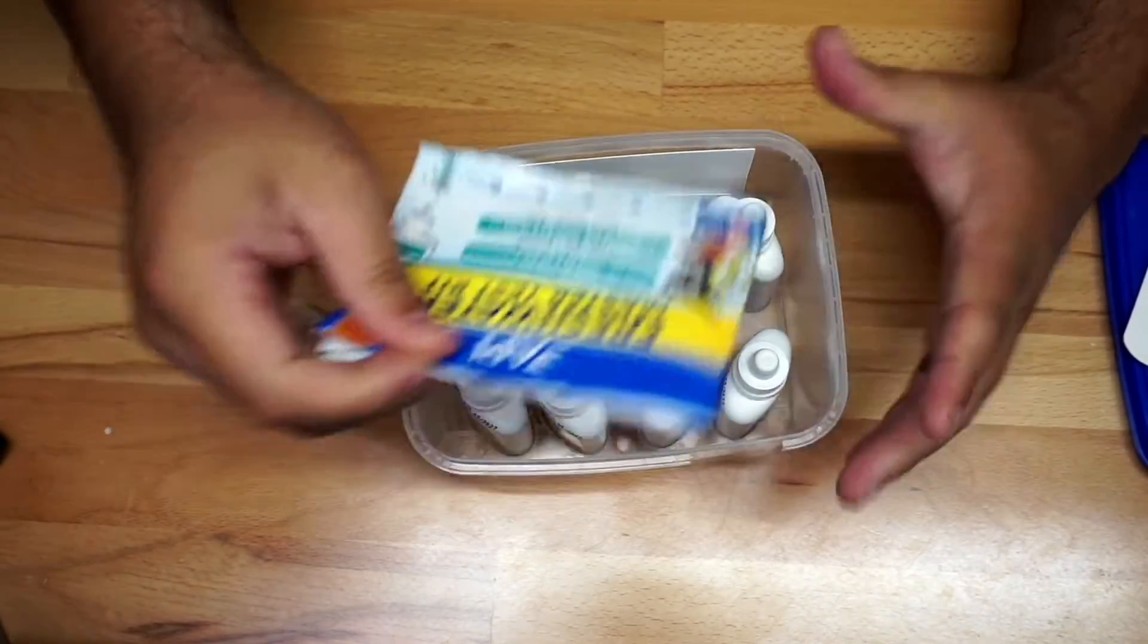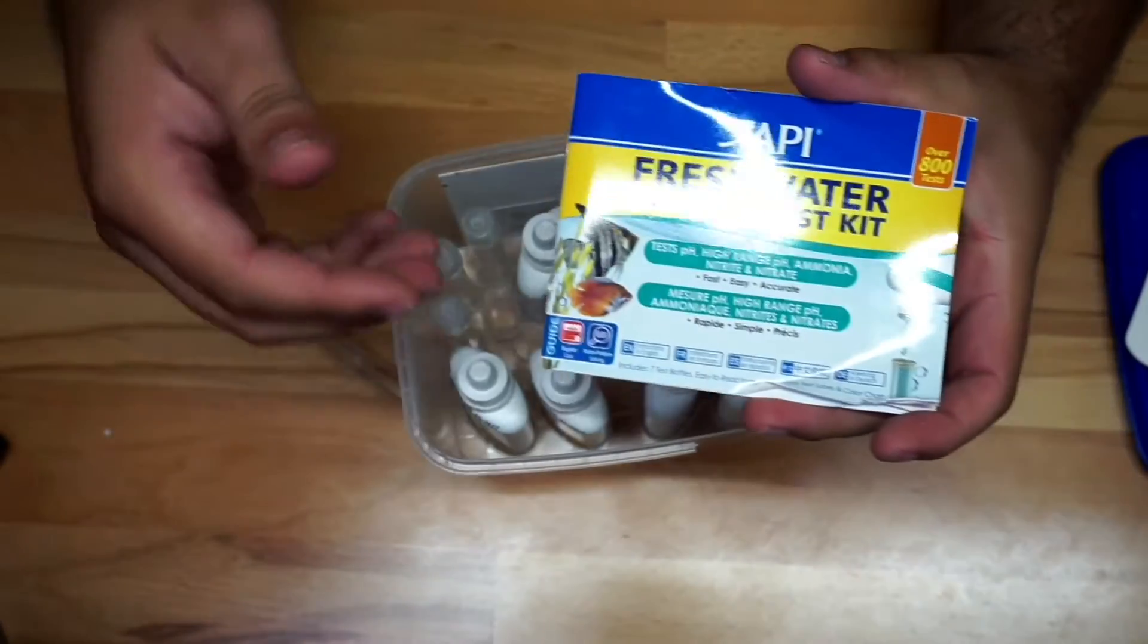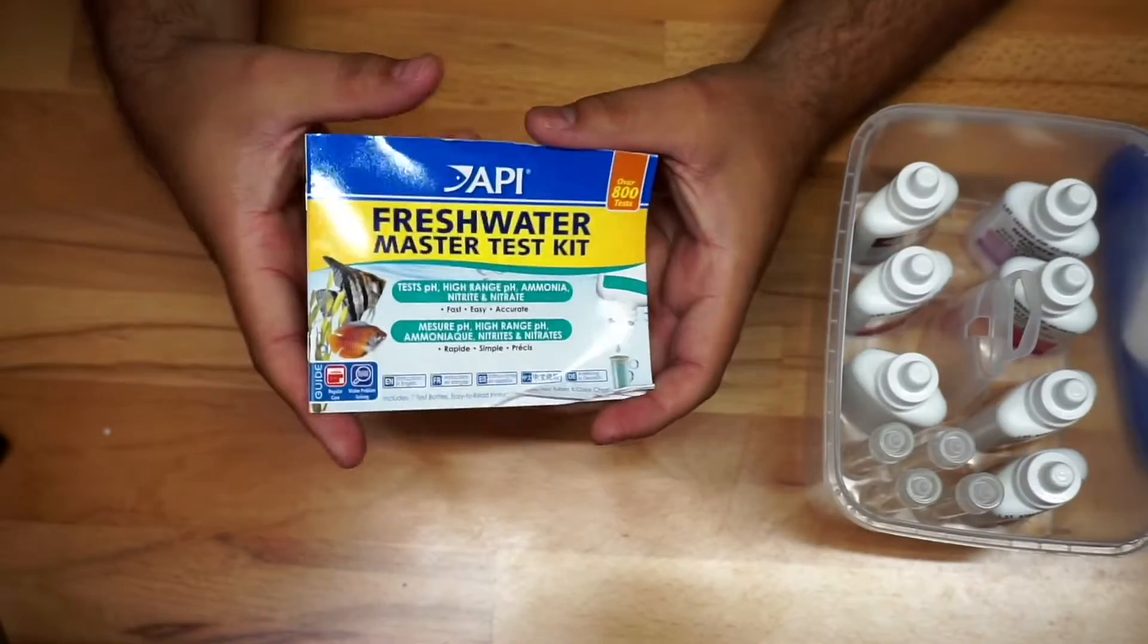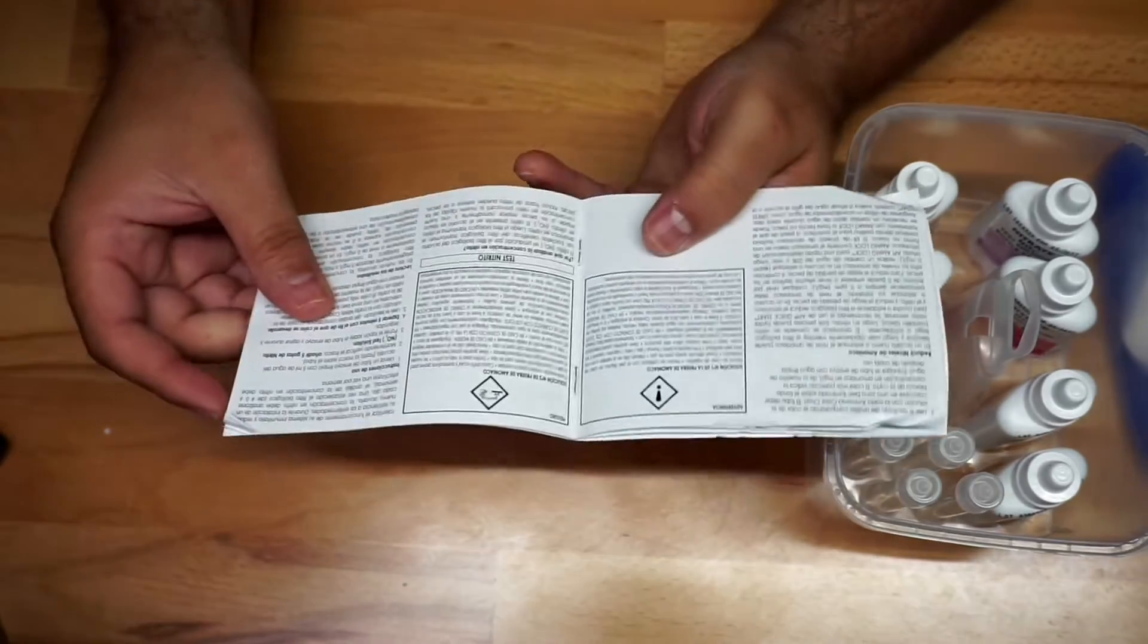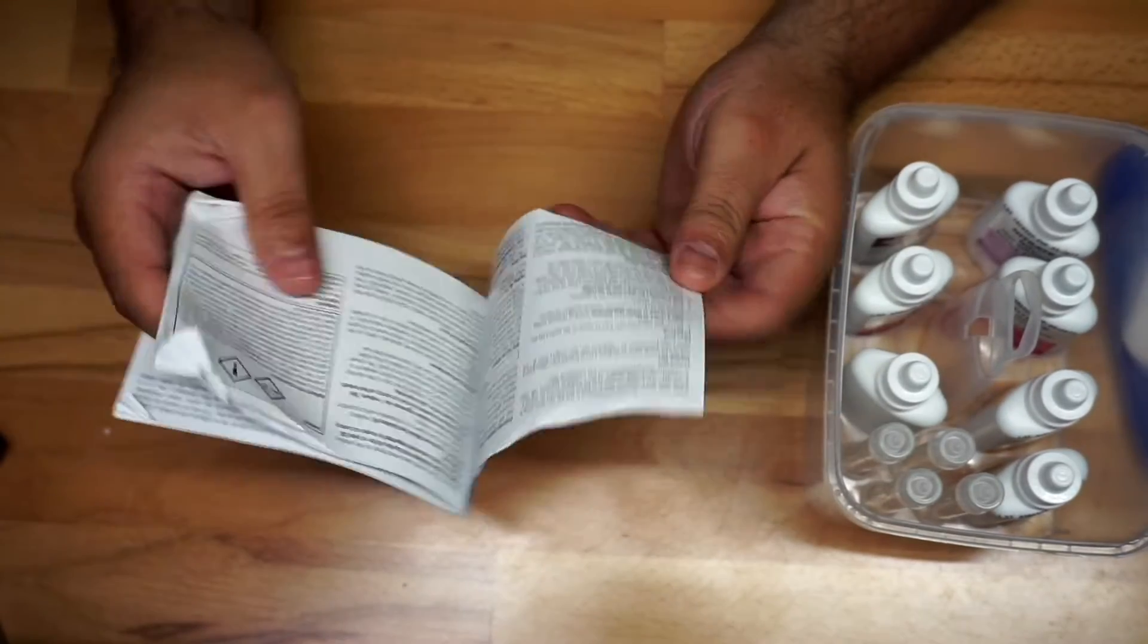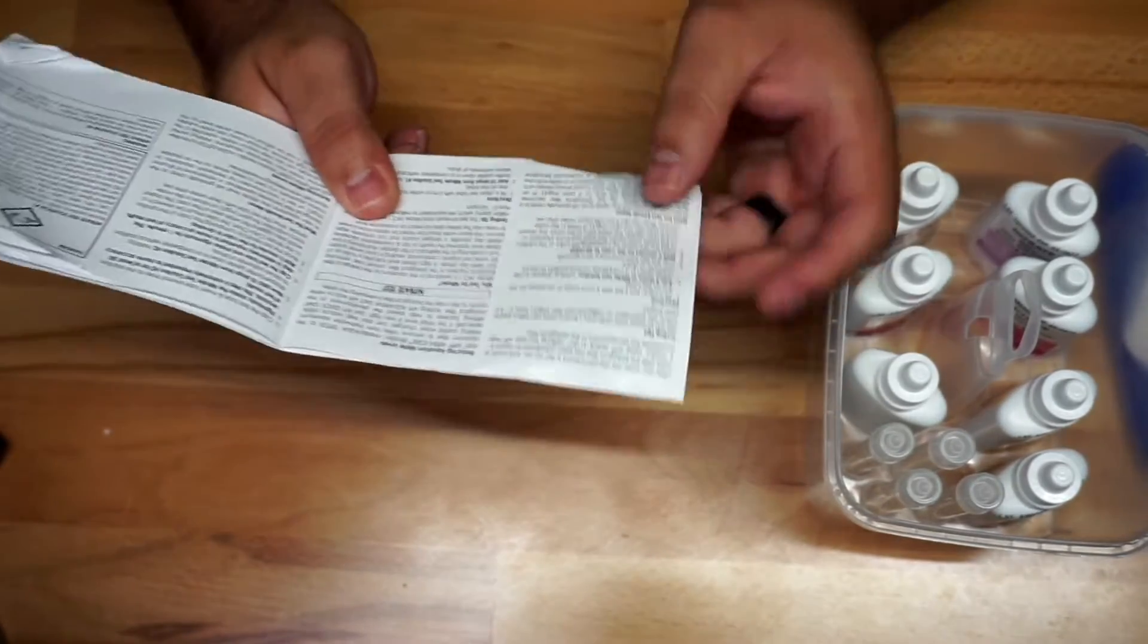It does come with instructions and you can see this. By the way, I have used this multiple times and if you see some of the instructions right here, very simple. I'm going to open this up and kind of show you right here.